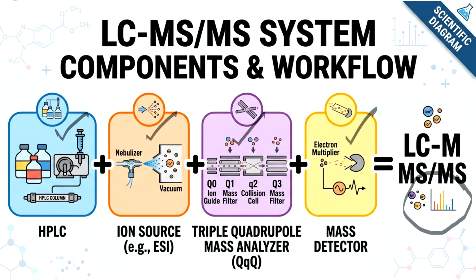In this session, I will teach you how one can say whether a compound contains a chlorine atom, bromine atom, or sulfur atom or not, having seen the MS spectrum.